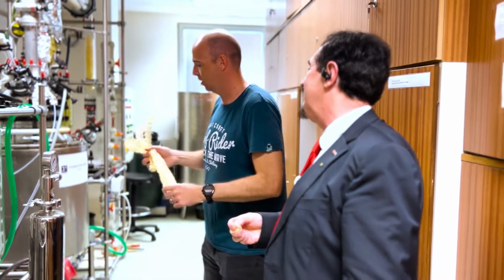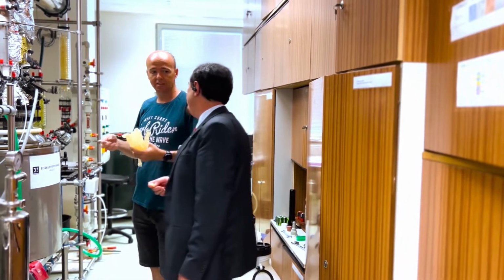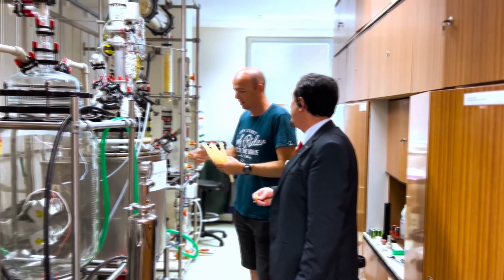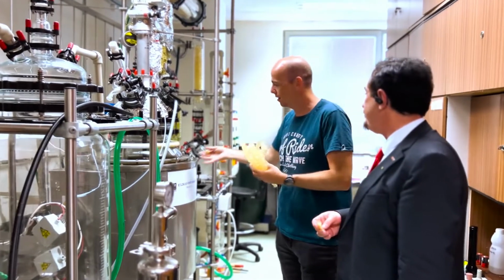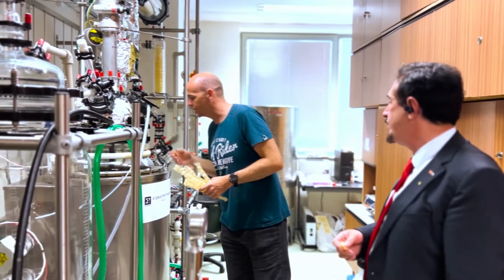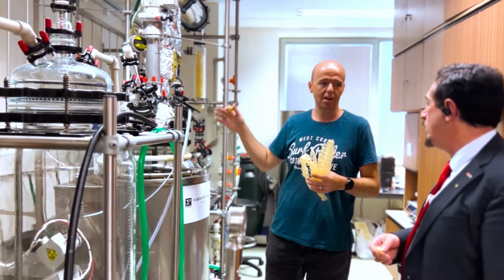It can be because immediately when we put it into the reactor and the mixture starts to stir, during the stirring the casing immediately starts to grow because of the air in the reactor and the water, and it starts to cause a problem with the stirrer. So that was the main problem during the scale up of our technology.